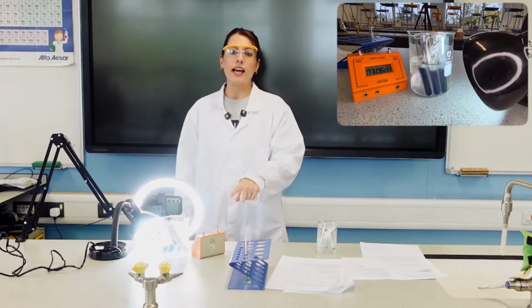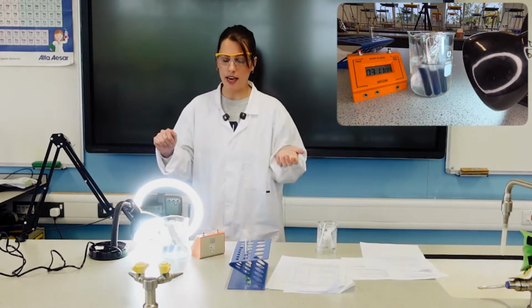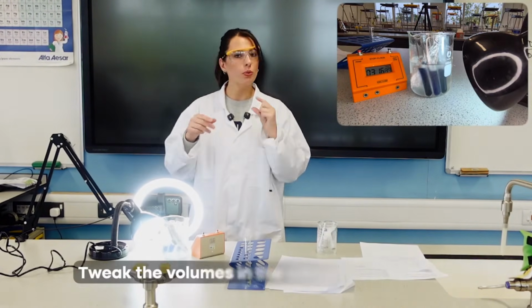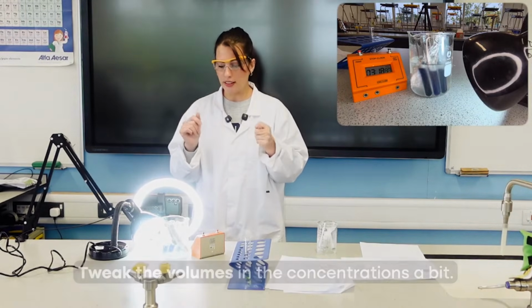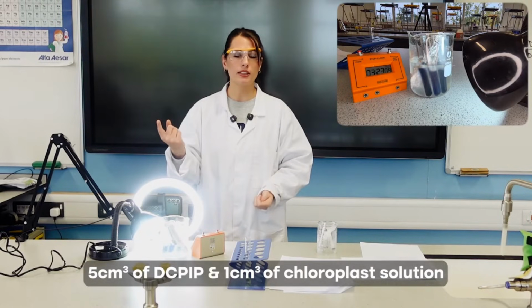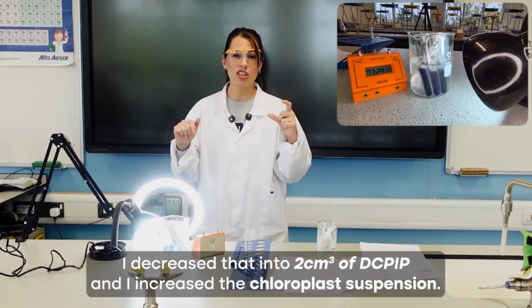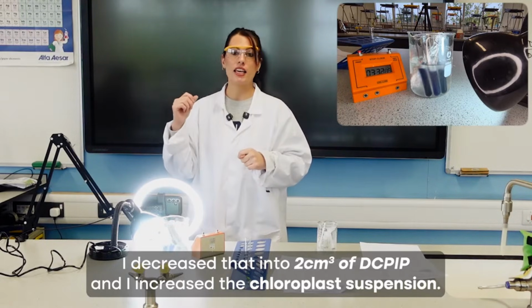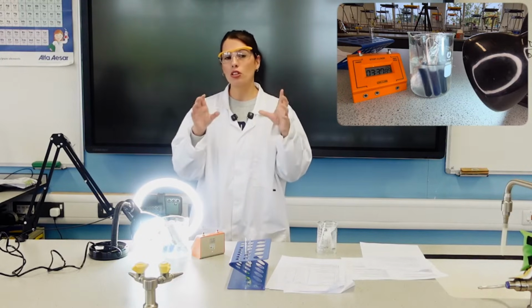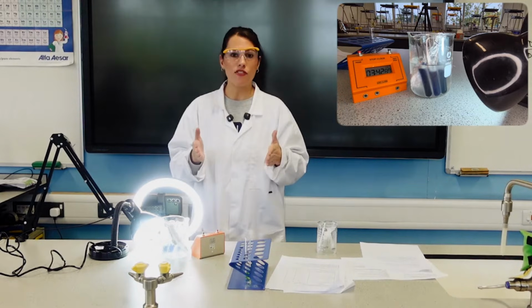So while that is reacting, this could take 5 minutes. I've had it where it's gone on longer than my hour lesson. So if you are finding that it's taking ages for those colours to change, then tweak the volumes and the concentrations a bit. I've got here 5 centimetres cubed of DCPIP, 1 centimetre cubed of the chloroplast solution. In the past, when it was taking too long, I decreased that to 2 centimetres cubed of DCPIP, and I increased the chloroplast suspension as well. Get your technician to trial it, or if you've got the time, trial it and see what concentrations and volumes work so that you do get results in the space of time that you have for your lesson.